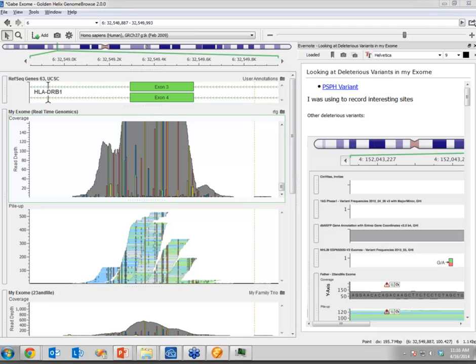So then, regardless of the issue with the false negatives, especially in the case of clinical false positives, what do you think about addressing it with Sanger confirmation? Yeah, so obviously that is still the de facto standard, given that there are very few FDA-approved medical devices that are only NGS. In fact, I think the MiSeq with CFTR is the only one. Maybe that's a little out of date. But confirming it with Sanger is still kind of the best practice for going into a clinical report.